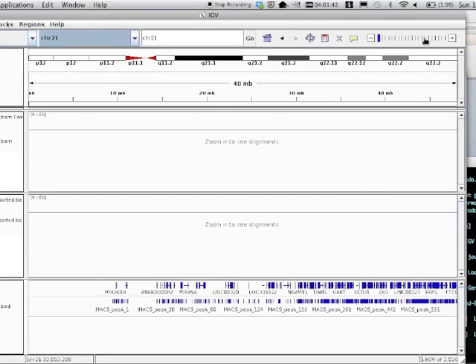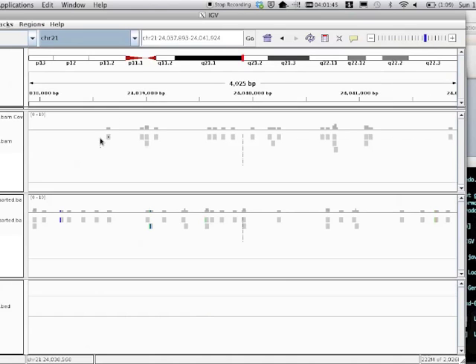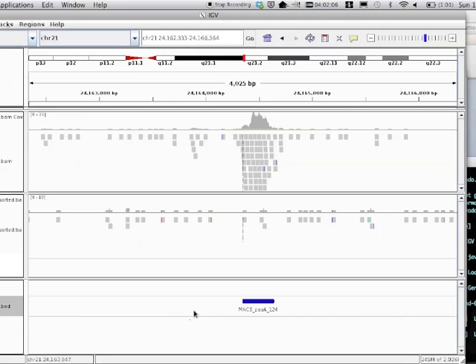Okay, and if I zoom, I can. So I'm looking at chromosome 21, where we sampled from reads just on chromosome 21. If I click this CTCF chromosome 21 peaks.bed, I can hit Control F and skip forward to somewhere where there's a feature in this file. So it's just going to skip me forward so I can see one of these peaks.